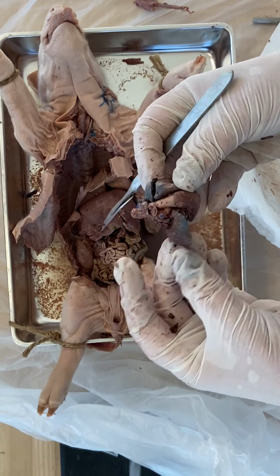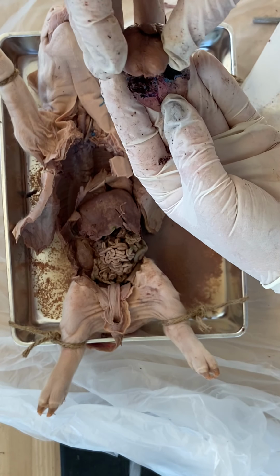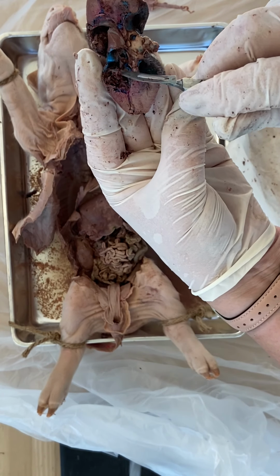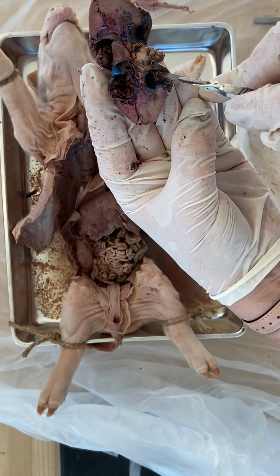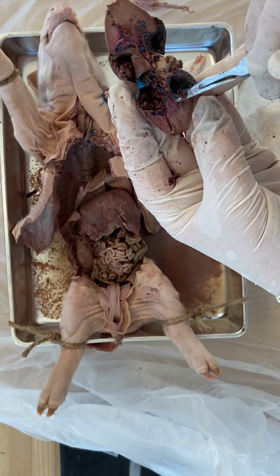Well, let's put him back together. So, as in your diagram, this is how we have our diagram. It's a bit messy, I know, but I think you can see right atrium, right ventricle, left atrium, left ventricle, and the valves, of course, are in between these.